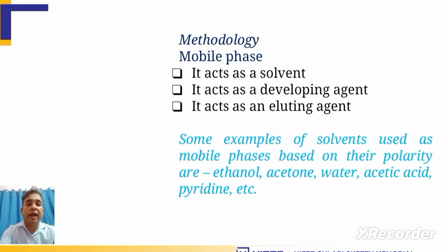When you pack the stationary phase, this same solvent system is used. When you have to load the sample, it cannot be loaded directly in solid form; it must be dissolved in a solvent. So this same mobile phase is taken, and the sample is dissolved in it and loaded.